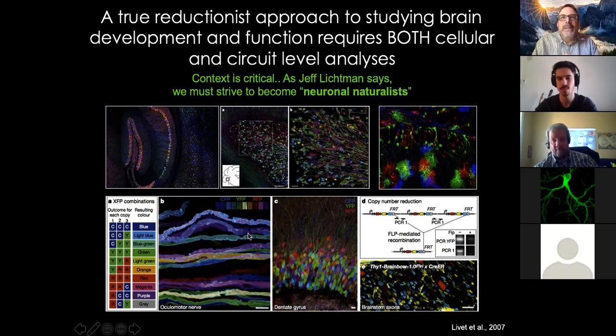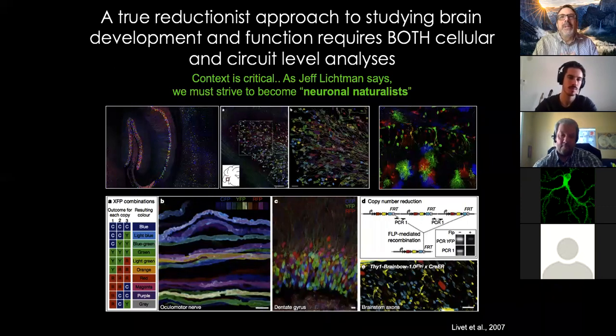Its spectral profile. And then you can use spectral analysis to separate the individual cells. Now, it turns out this is much harder to do well in practice than in theory, but it does generate these beautiful images of the complexity of the central nervous system. So here's the hippocampus that we were looking at before, now shown in its full glory, all of these cells in the dentate gyrus, and what a forest this is.